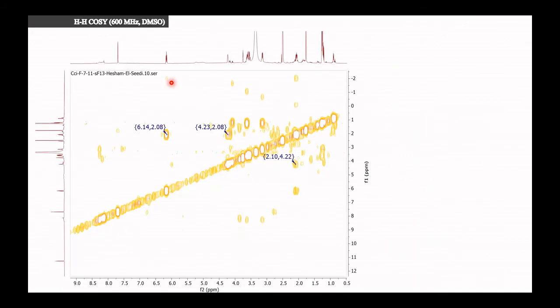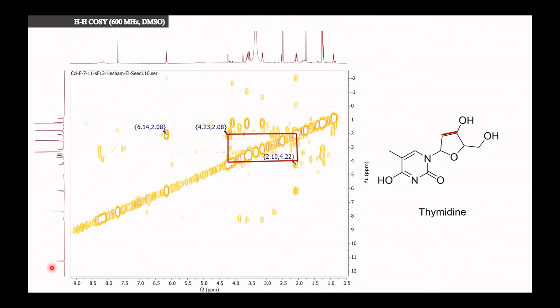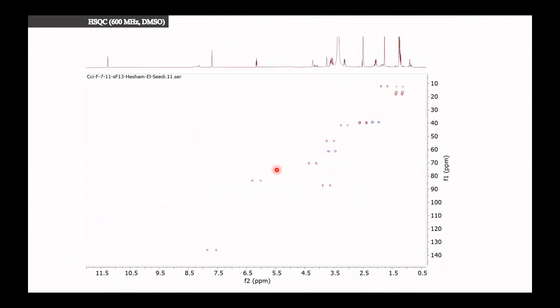Now, I will show you the spectra. Now we can see proton NMR from chemical shift. And from chemical shift here, another proton. It means it is HH COSY. Could we see the correlation? We will give example, like these 2 protons. You recall where's the chemical shift? Then you can find the square here. So now it is approval of 2 adjacent protons. If you take another 2 protons, you will see, etc.